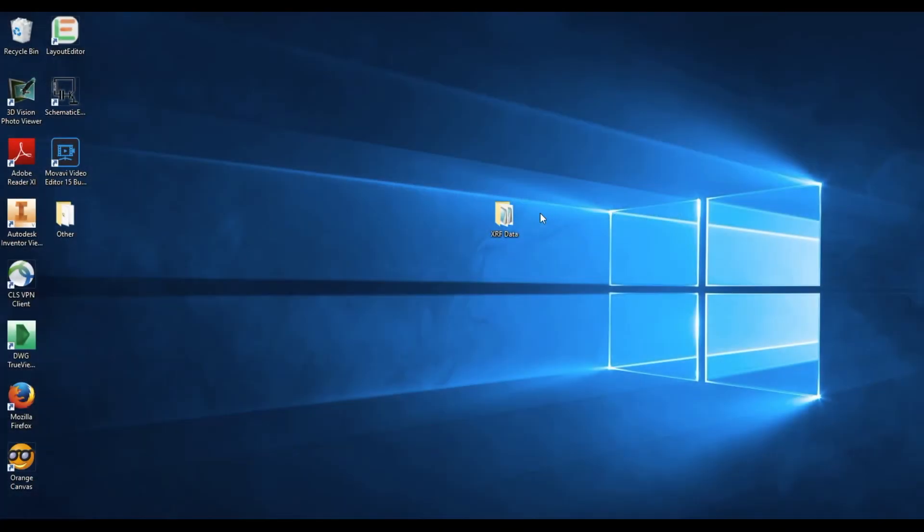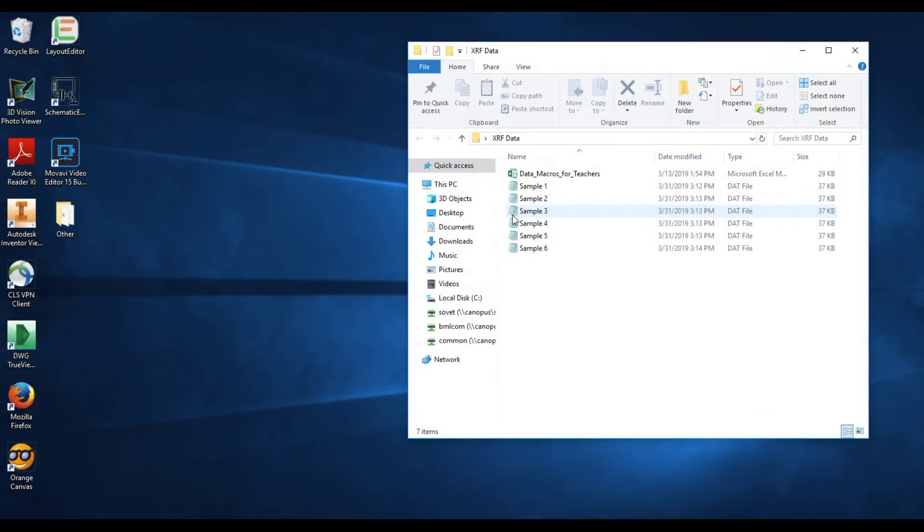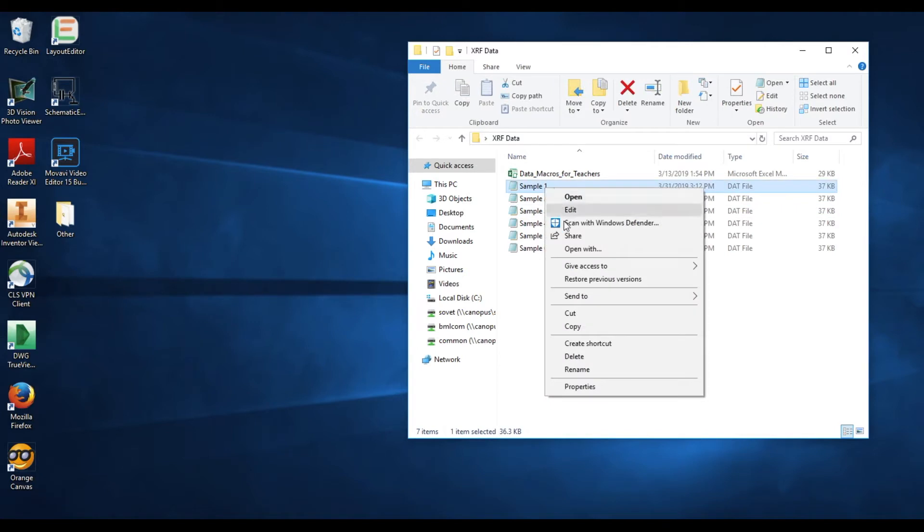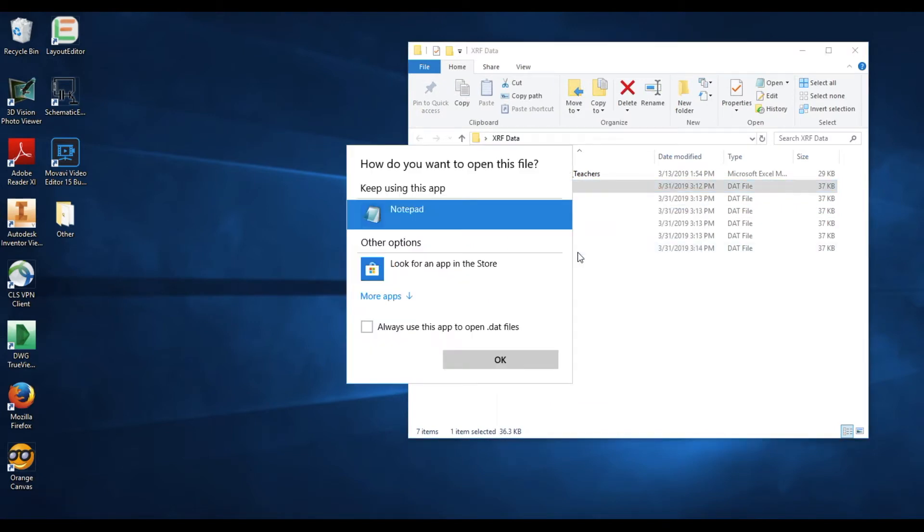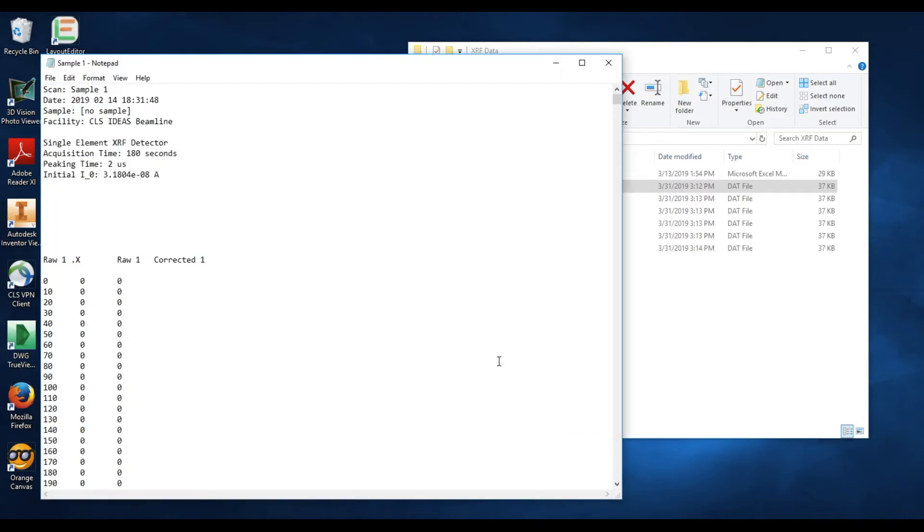To create an XRF graph from data acquired on the IDEAS beamline without using the provided macros Excel file, simply open up the data folder containing your data, right-click your first sample set, and select the open with option. Now choose any text software you're most comfortable with. Notepad is probably the easiest to use. Once you've made your selection, choose OK.